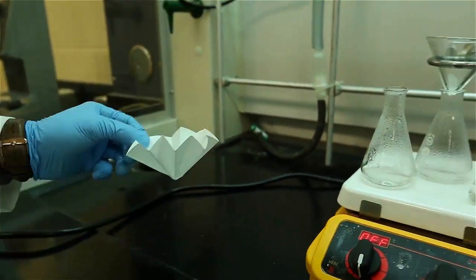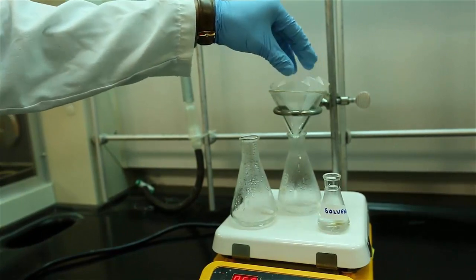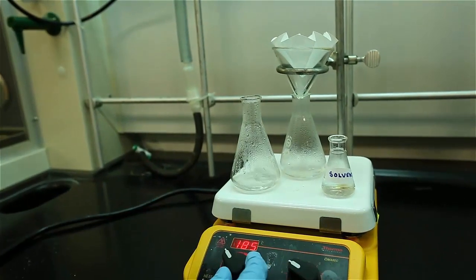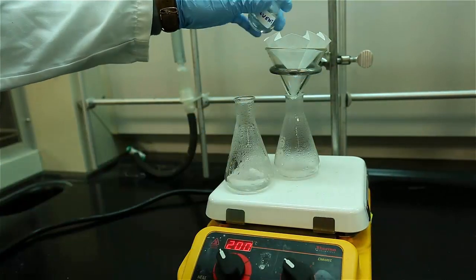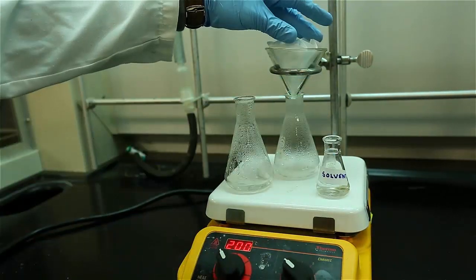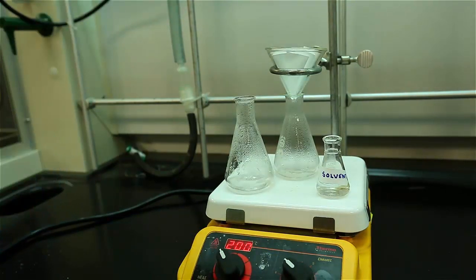Before filtering your solution, ensure that the funnel is as close to the mouth of the Erlenmeyer as possible and pour small amounts of hot solvent through the funnel and filter paper. To save time, the preparation of the gravity filtration setup can be done while the solvent is dissolving the solid.